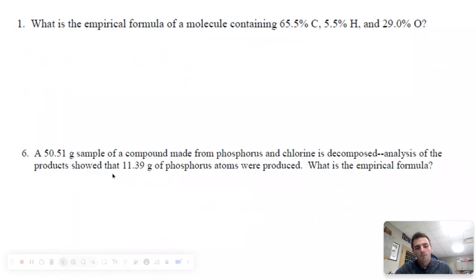So just leading in, we've done empirical formula problems where you've had the percentages. We've done empirical formula problems where you've had grams. We know in my class we teach GMS, so with both of these situations, we want to get them to grams and then simplify with moles. These have been problems on paper. We're now actually going to do some of the physical exploration of getting those grams ourselves.